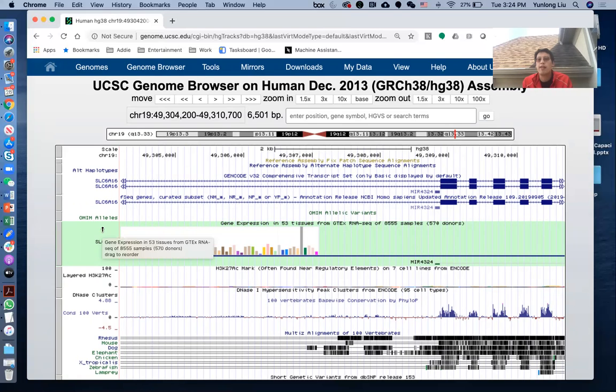As I mentioned earlier in one of the lectures talking about the different ways of putting data into the Genome Browser, this is the second part of it, which is you put your own data on one of your HTTP servers, and then you only send the link of this data set to the UCSC Genome Browser.